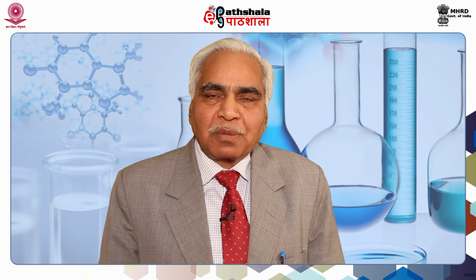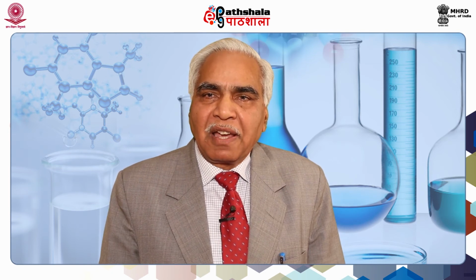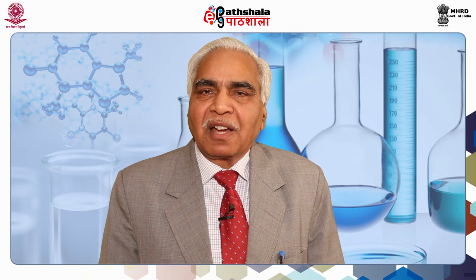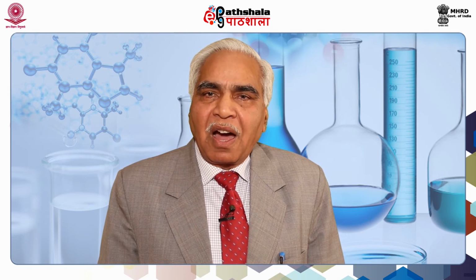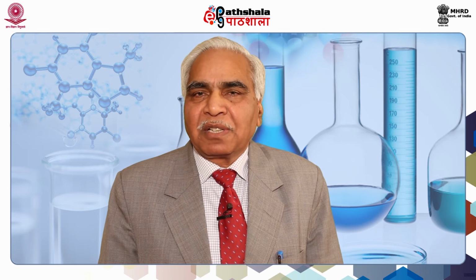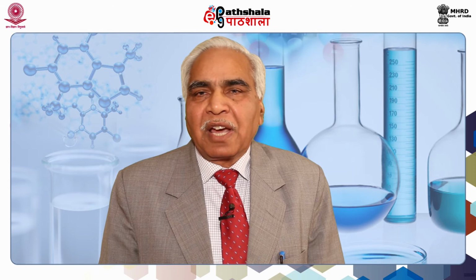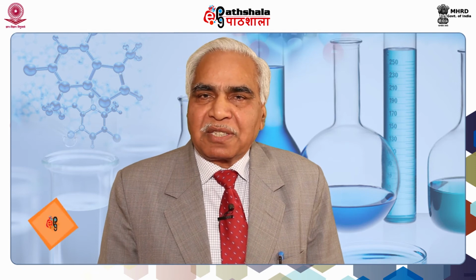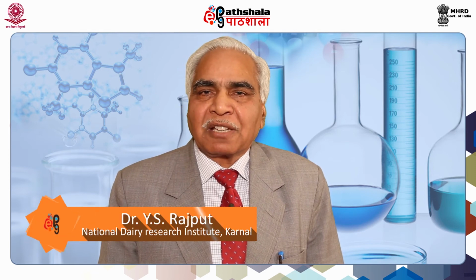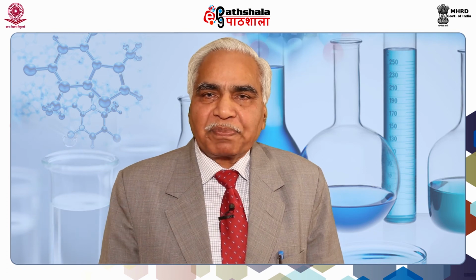Now my focus will be on the practical aspects of the isoelectric focusing technique, in which we will discuss how the sample can be prepared, how the gel can be cast, and how these can be stained. We will also discuss whether this technique can be used in conjunction with SDS-based gel electrophoresis. That is what is referred to as two-dimensional gel electrophoresis. We will see more applications of the isoelectric focusing technique in two-dimensional gel electrophoresis.